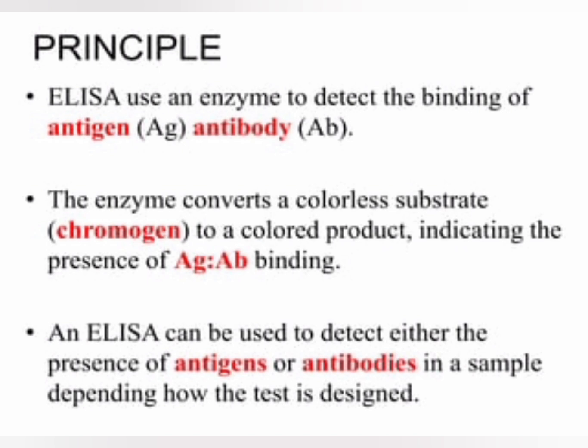Competitive ELISA is essentially identical in principle to the competitive RIA, therefore being a classic inhibition type assay. The color produced in competitive ELISA is inversely proportional to the concentration of antigen.